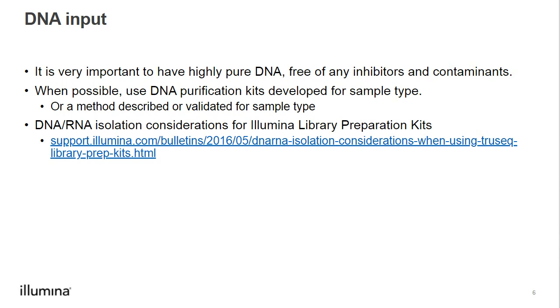I will include resources a little later that discuss extraction and purification methods for some of the possible sample types. And then the bulletin at the link here includes information about possible inhibitors and contaminants, their sources, how to check for them, and how to remove them from our samples.